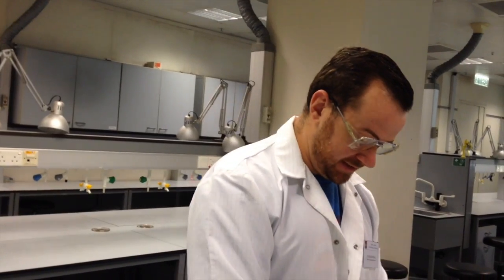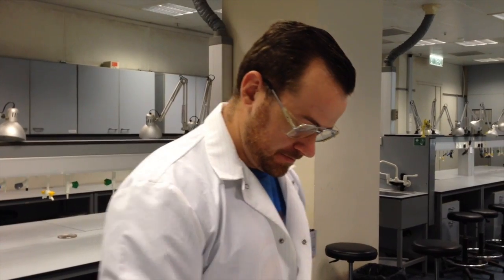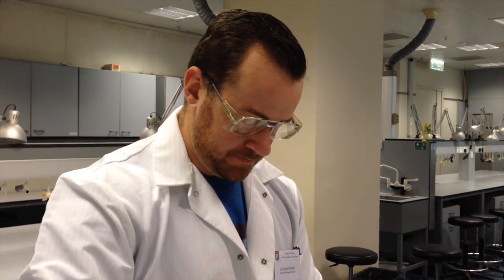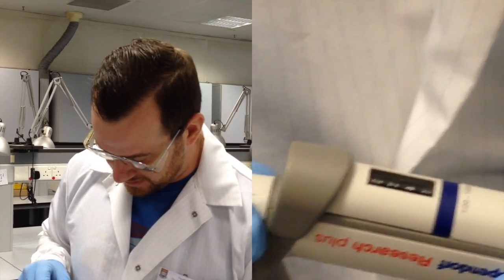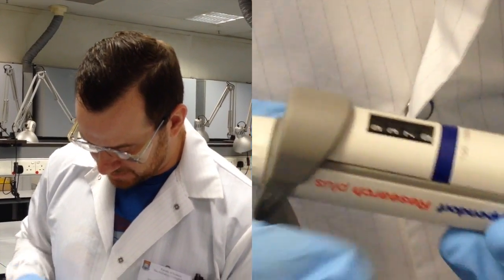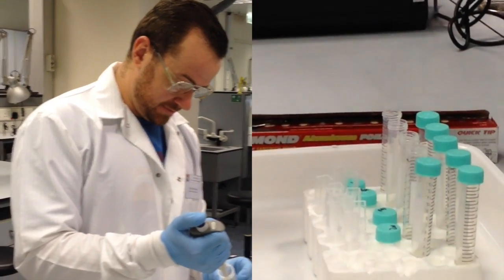So once the nitroprusside solution is added, I need to do a quick mixing once again, and then I'm going to wait for 1 minute before adding the oxidizing reagent. Alright, the final step is adding the oxidizing reagent that we prepared. The volume that's required is 0.37 milliliters, or 370 microliters. So I'm going to change the dial again. I'm going to increase the value to 370. There we go. And I'm going to add that volume to each of my reaction tubes.